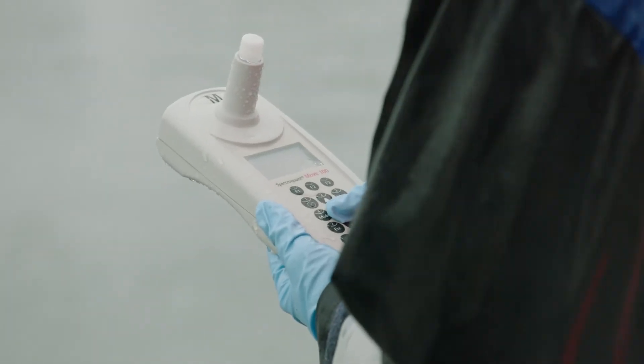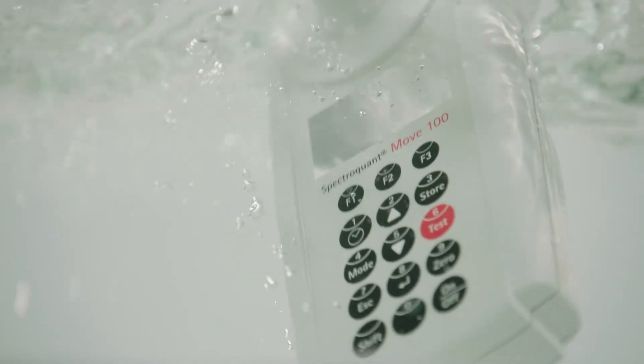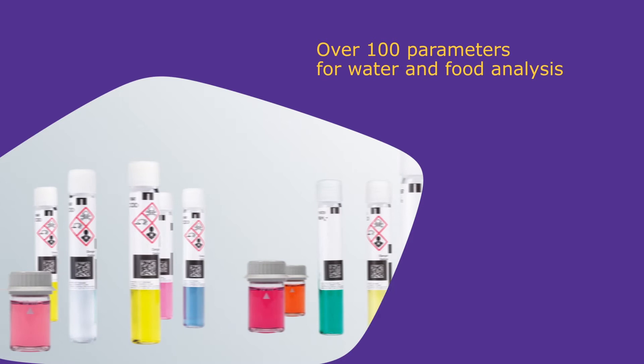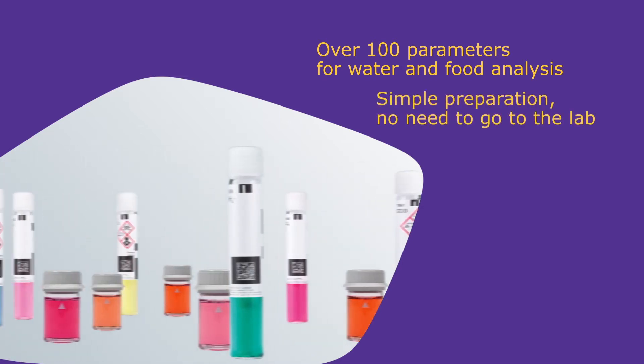Since the MOVE works with batteries, it can be taken to the site of sampling. With its dust-tight and waterproof construction and without any moving parts, the MOVE 100 is perfect for on-site measurements. For food and water analysis, there are a wide range of test kits for over 100 parameters. Most samples can be tested without the need for complex preparation.